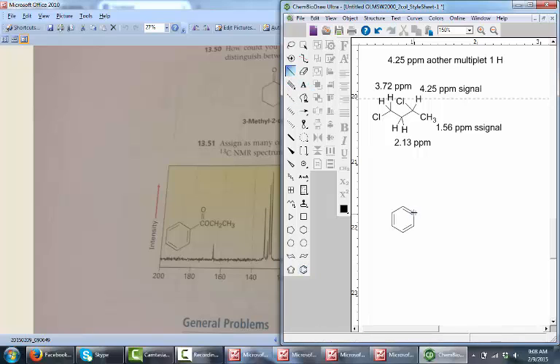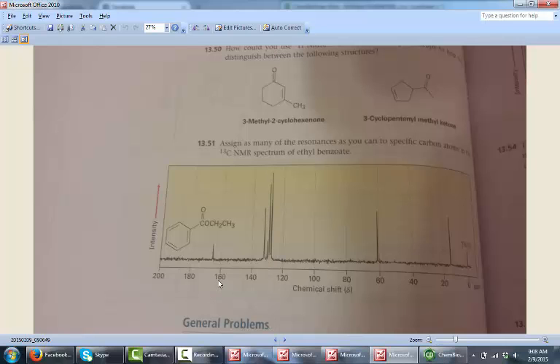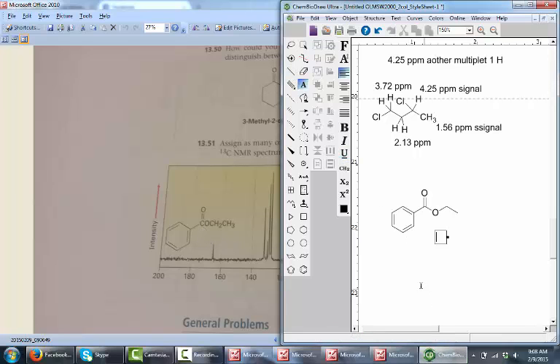The first thing I would say is carbonyl carbons, okay, so the carbons that are directly attached to a carbonyl, those have pretty characteristic peaks in the carbon NMR spectra. Those are way deshielded. Those are always the least shielded ones. So when I see here this peak at like 165 ppm, something like that, I know for sure right away that's my carbonyl carbon. So here, let's put that one in.